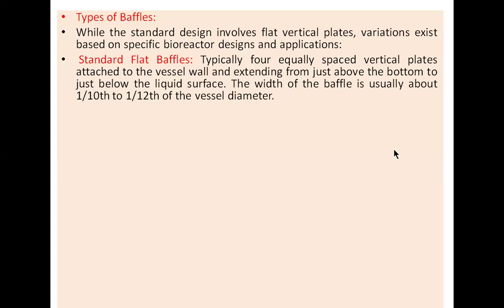Under types of baffles, the standard design involves flat vertical plates. Variations also exist based on specific bioreactor designs and applications. It's not like there is only one type of baffle. There are so many other different types of baffles.